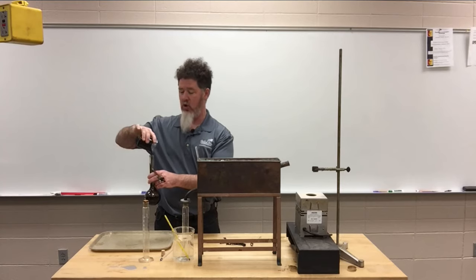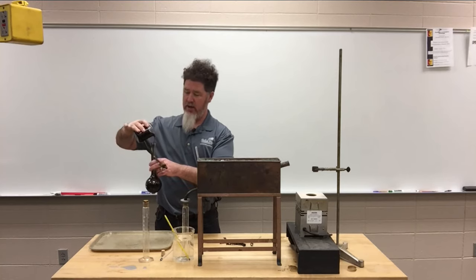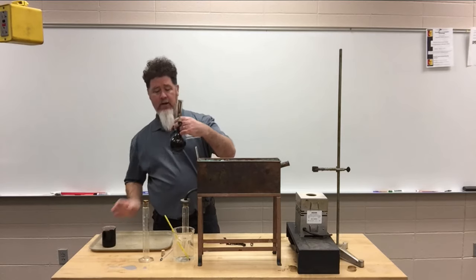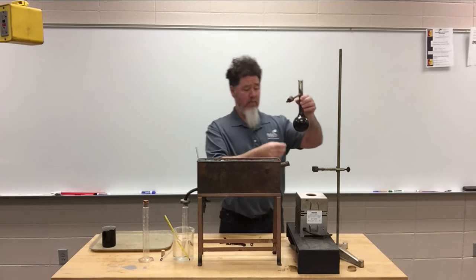And again, crude oil is very runny. It's not like motor oil. Motor oil is separated out of the crude oil, so it's very, very runny, and it's a very dark black, black gold is what they said, right? We're going to let that settle in my flask while I'm getting everything set up.